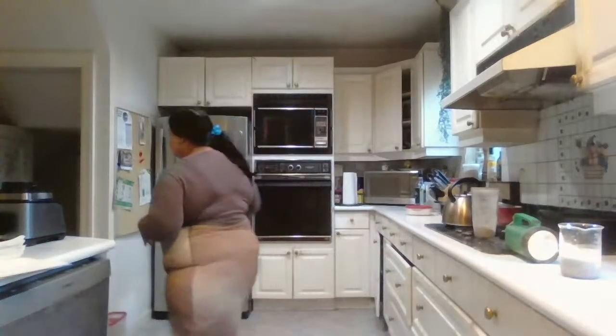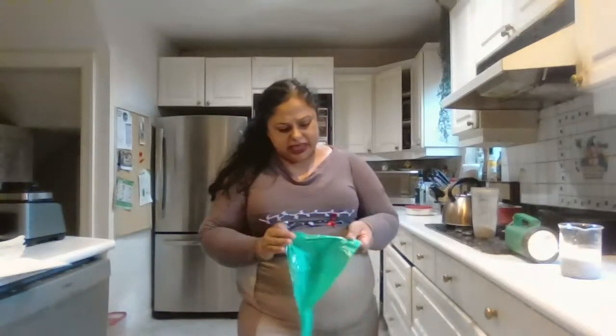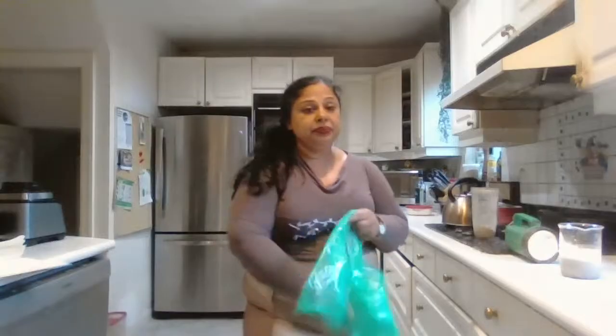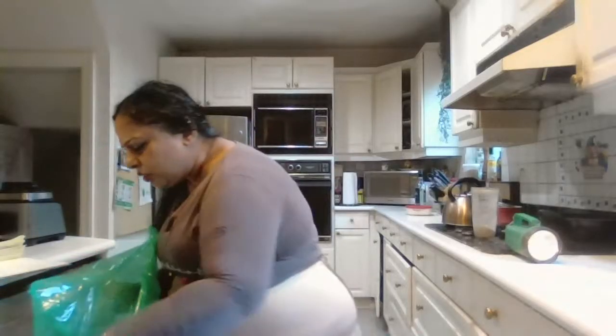So this is done. I'm going to just suck this out and put the other one. Just based on those two, I'm going to reach a conclusion because the calibration curve is going to take too long. Okay, let's see if it's going to match. Or it could be more. But oats is one of the highest. So copper always has to go into the garbage. Very toxic.